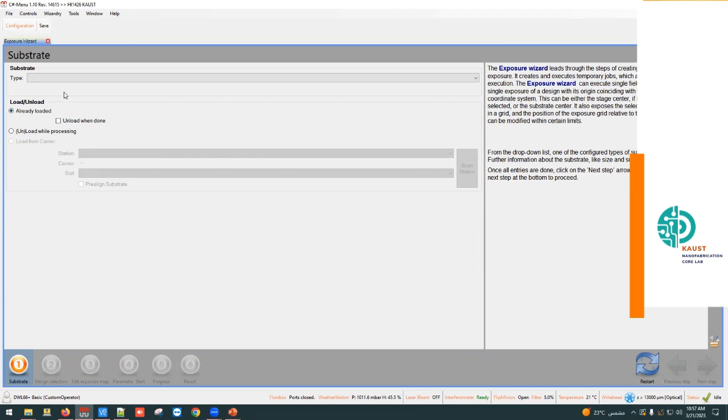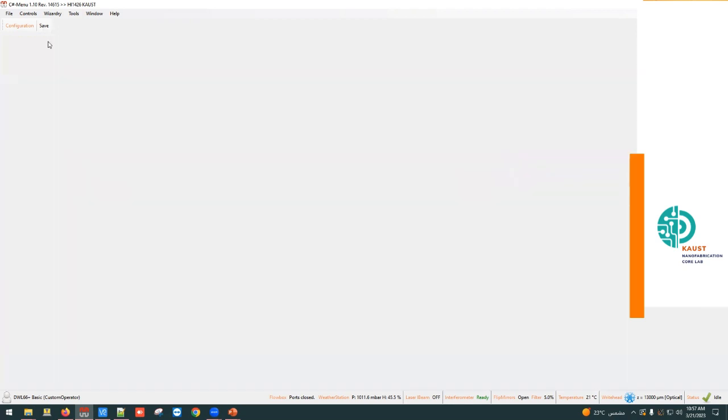So, Erica, sorry, the placing cross is not visible on the video. No one has seen it? If not, this is not really important to place it. I'm going to close it again and do it again.